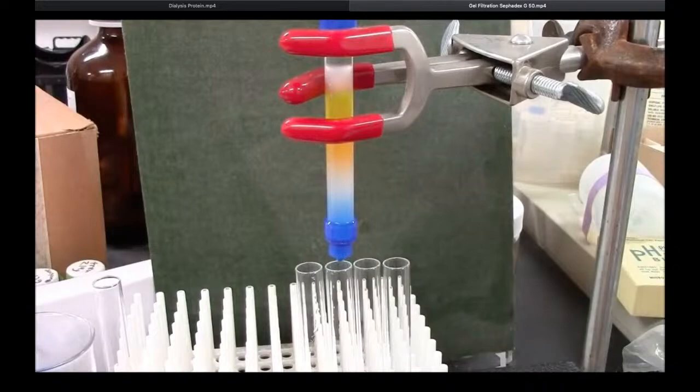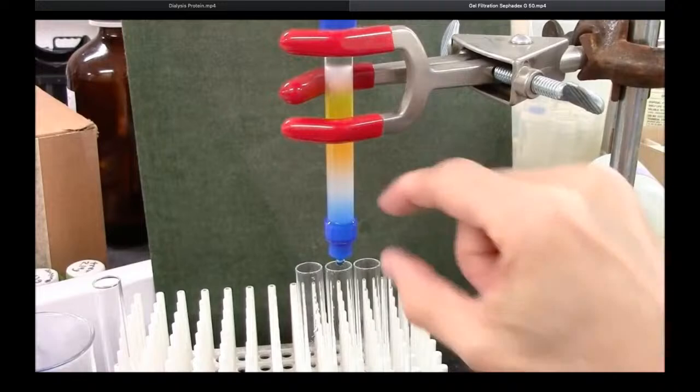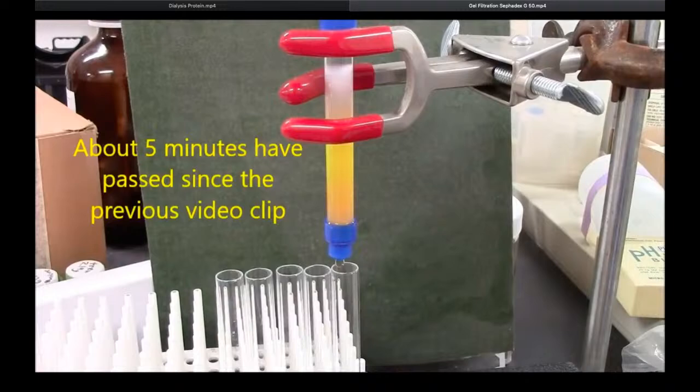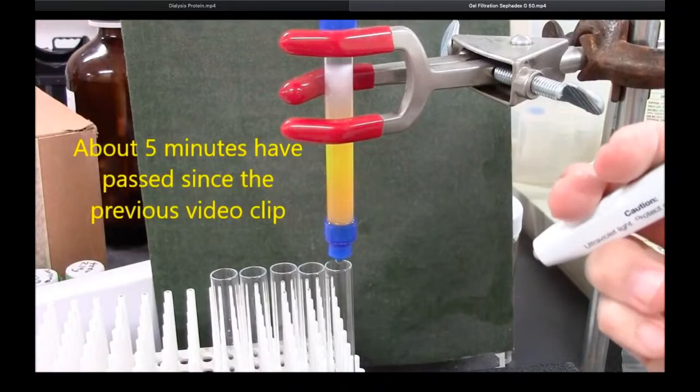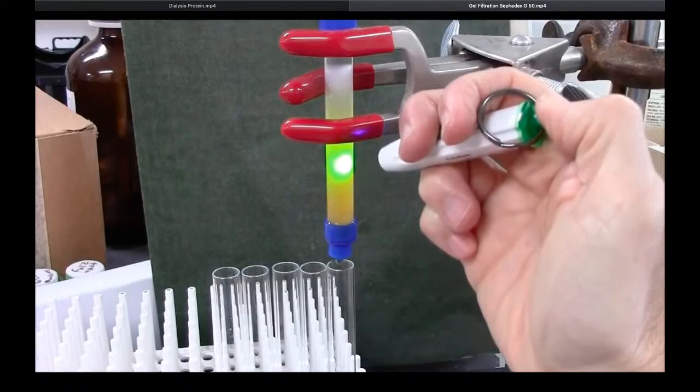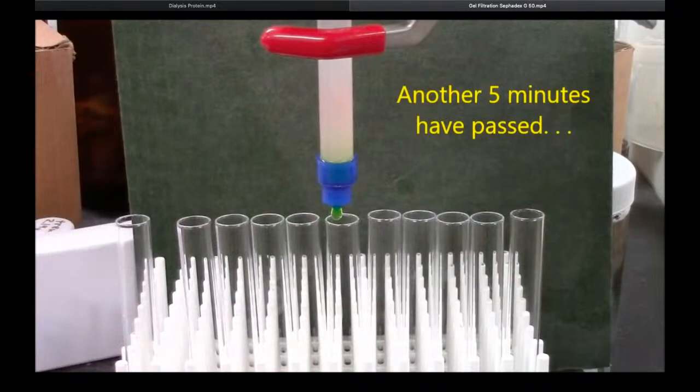So this technique is often used to separate a protein, which is large, from the small molecules that could be salts or could be a fluorescent tag that is unwanted. I've topped up with buffer on the top so that it never runs dry. The fluorescein is now eluting from the column. Fluorescein is fluorescent. I'm shining a little blue light, UV light on it, and you can see it glows green. The last little bits of fluorescein are emerging from the column now.